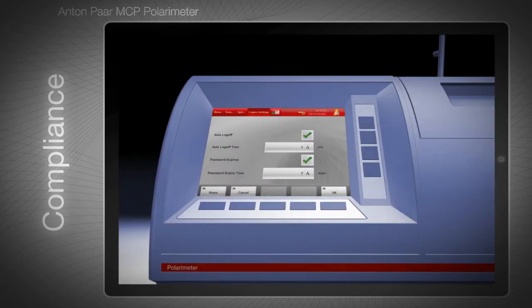The instrument can automatically log off after a defined idle time. The user then has to log on again with username and password.